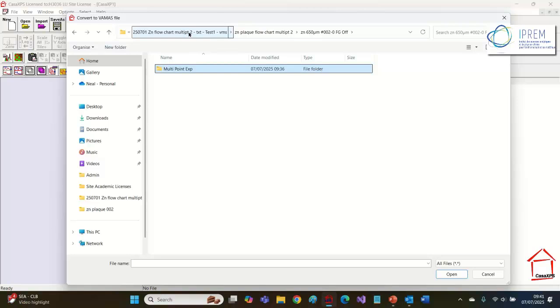For example, in this version of Windows, I wanted to change the file extension of an AVG file to a TXT or some other file extension, and I was unable to do that. It objected to the length of the file. Sometimes when you unzip a directory structure like this to a directory that is deep within some other directory structure, that too, the unzip process fails. So it's probably a good idea not to make these paths too long.